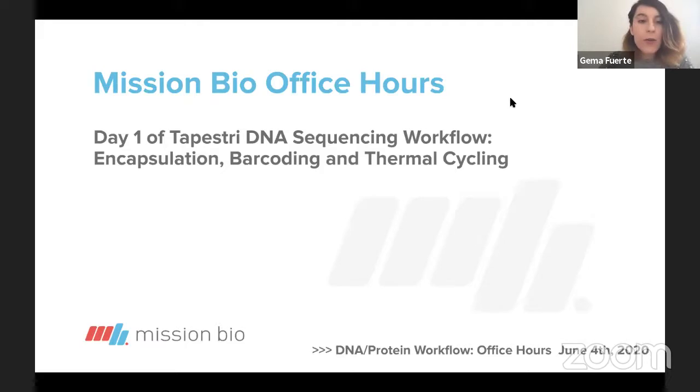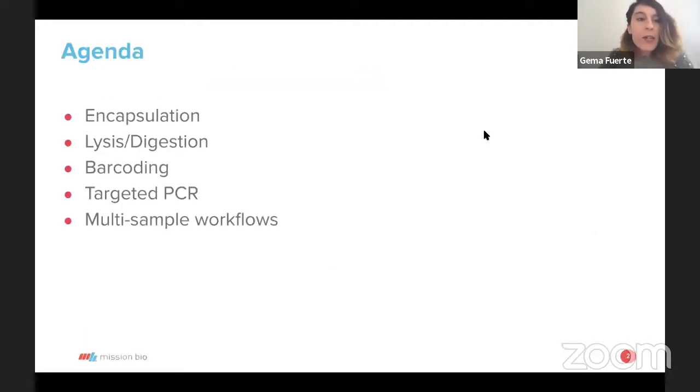So let's just go through the agenda quickly. As Kelly said today, we're just going through the steps of the Tapestri workflow. So these are encapsulation, lysis, barcoding, targeting PCR, and then we will take a little bit of time to talk about multi-sample workflows.